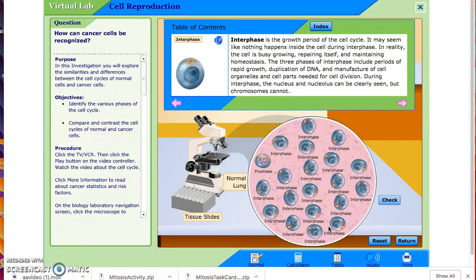anaphase, telophase. Now, where it comes to percent of dividing cells, you're going to count up all of these cells. So if I look, I've got 1, 2, 3, 4, 5, 6, 7, 8, 9, 10, 11, 12, 13, 14, 15, 16, 17, 18. I got 20 cells here, okay? The percent that are dividing are the ones in prophase, metaphase, anaphase, and telophase. So if I do that, I have 1 that is dividing, okay?